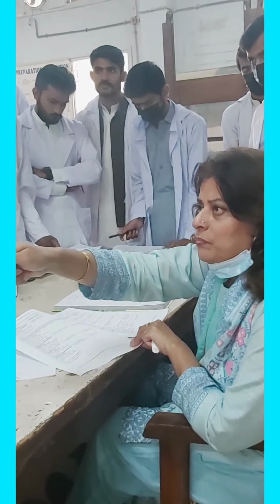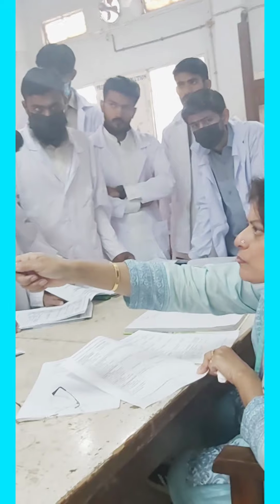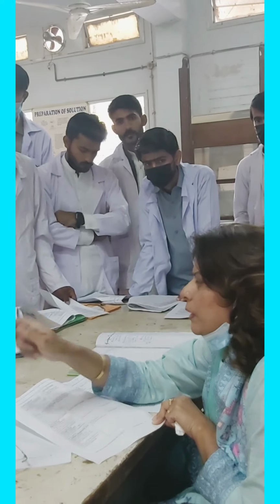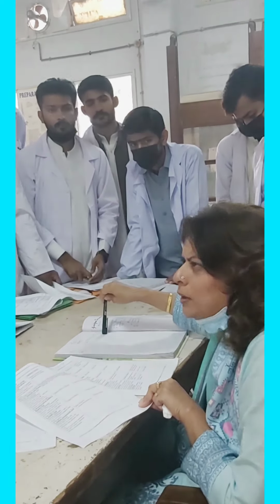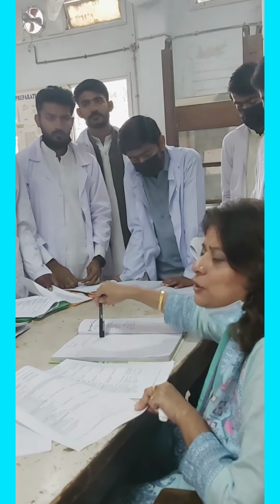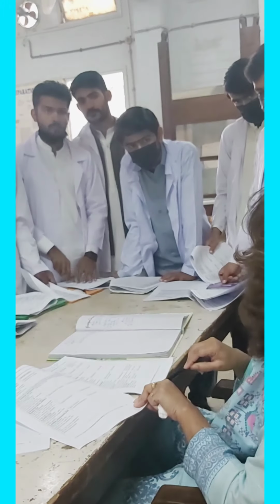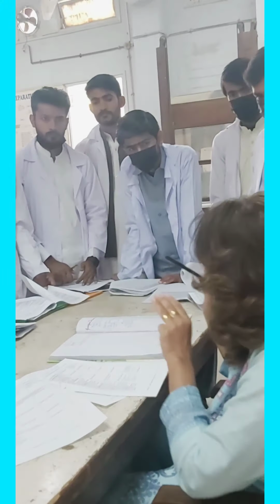Why? You tell. Ma'am, if we get a negative result first, then we will not do the other. Ma'am, according to the previous session, we can find our new experiments. Okay, only that is the reason. Can't you see it's a known compound? And we know that our compound contains these functional groups only. So we are going to perform the functional group test for these two only. That's it. We are not going to do all the tests. You have to move on with the tests you are supposed to do.